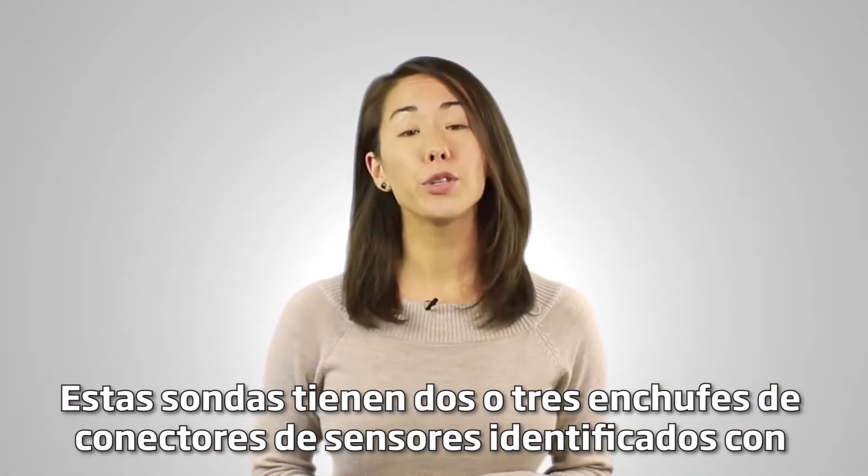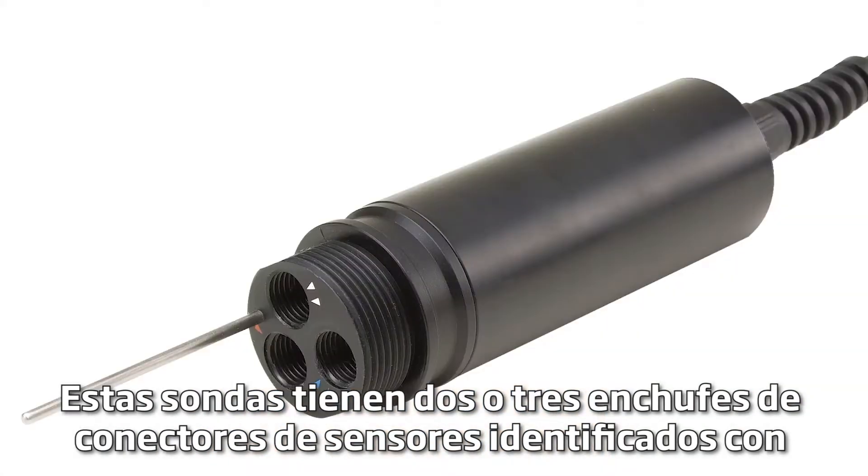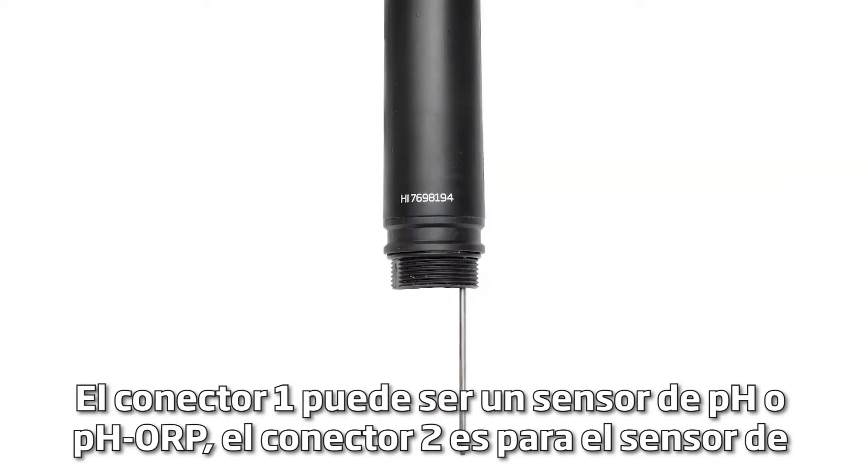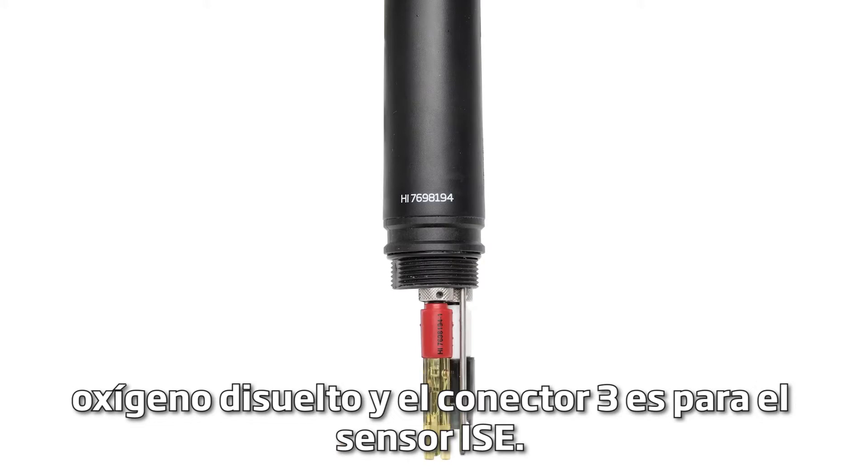These probes have two or three sensor connector sockets identified with color-coded triangles. Connector 1 can be a pH or pH/ORP sensor. Connector 2 is for the dissolved oxygen sensor. Connector 3 is for the EC sensor.